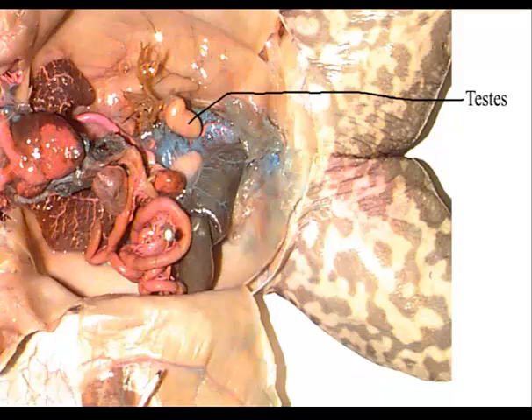Another way to help find the testes is the fat bodies. The fat bodies in your frogs are going to be big and fairly yellow. If you can trace them back to their origin, they're going to originate from the testes.